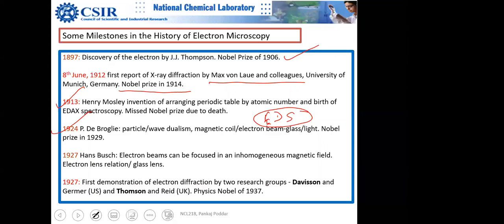So basically there was a lot of effort by scientists to make electron lenses. So please know that similar to optical microscopy, where we need better and better lenses, usually those are borosilicate or some other glass material, here also we need to have lenses. So these lenses are magnetic lenses. Those are basically made, you have to have a magnetic field. So the magnetic field is able to drive the electrons the way we want, right?